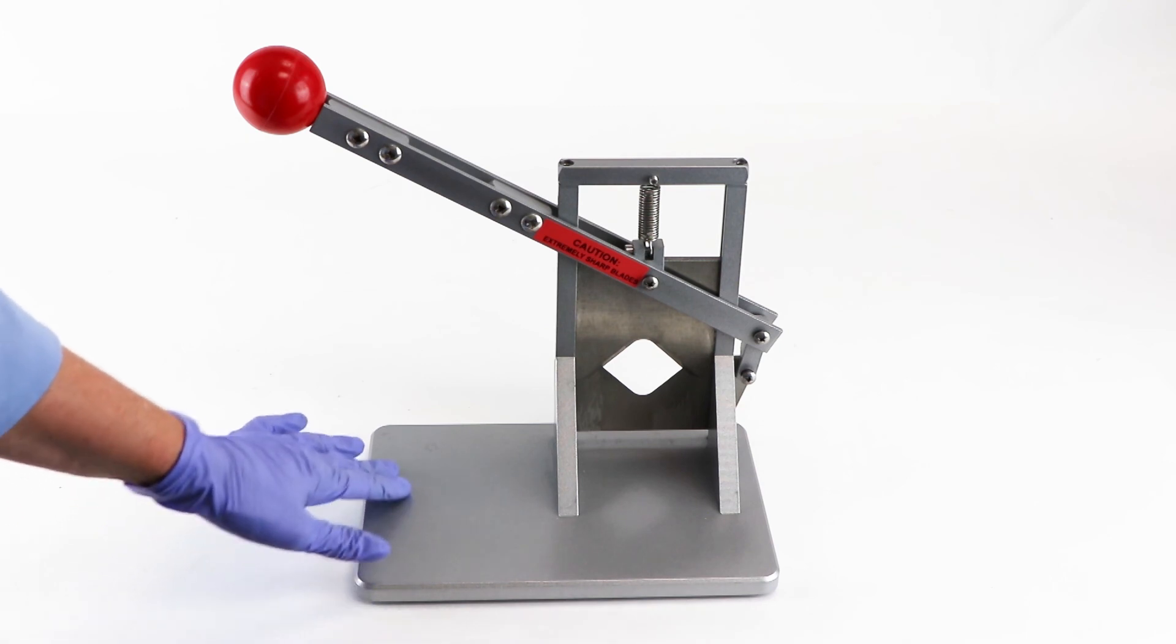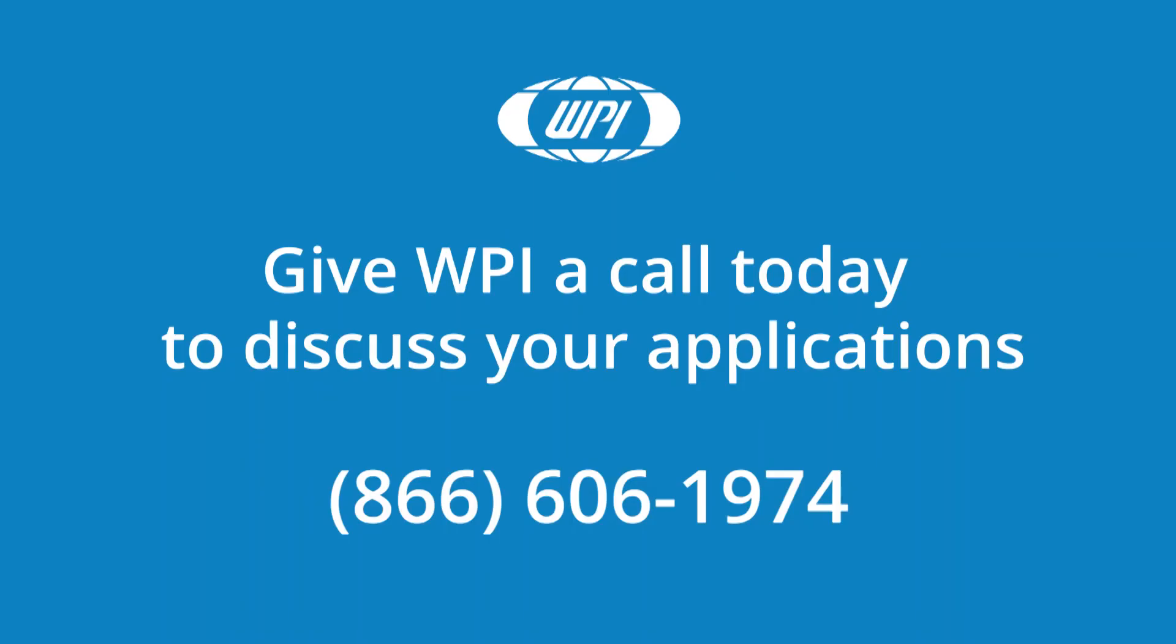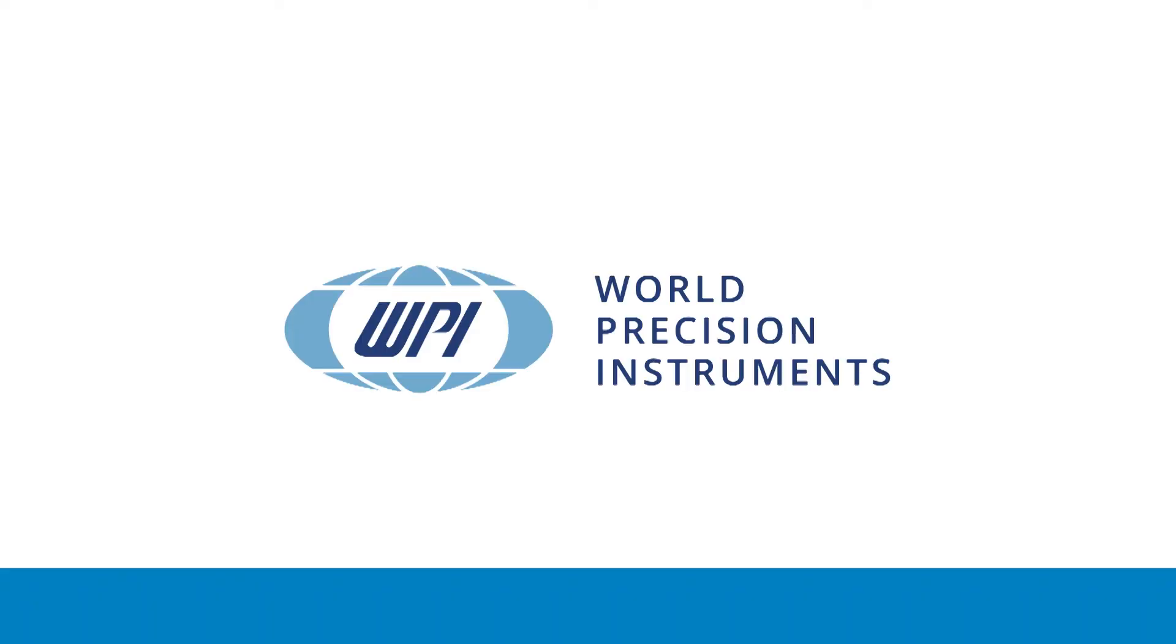The decap guillotine is easy to use safely in your laboratory. If you have any questions, just give us a call.